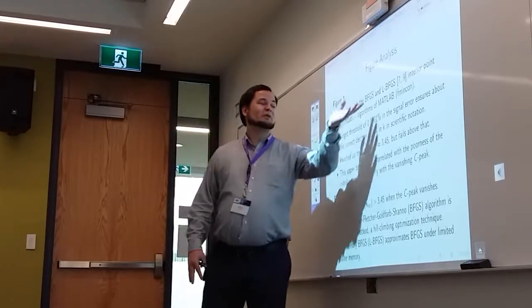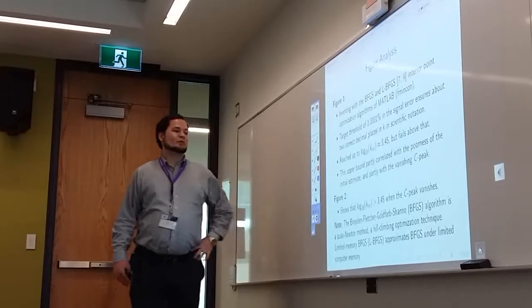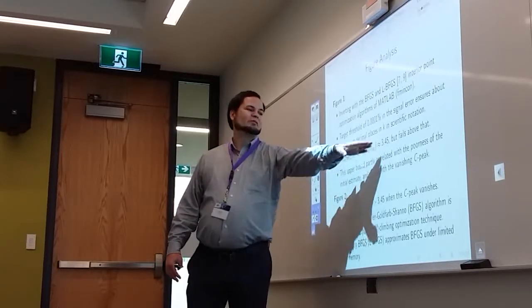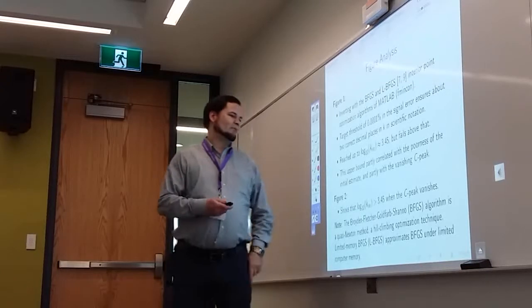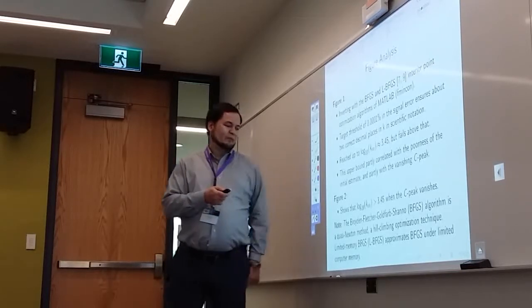They are built-in algorithms in MATLAB; fmincon is the subroutine. The target threshold is very low, 10 to the minus 4 percent, and it's reached up to about 3.45, correlated with the disappearance of the CP, the left peak.